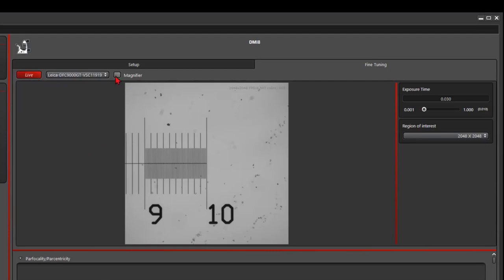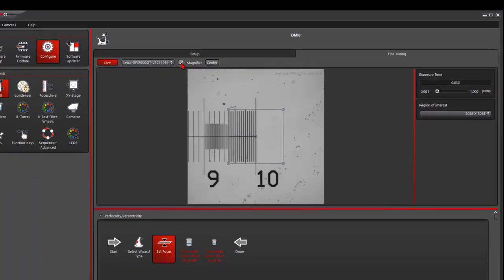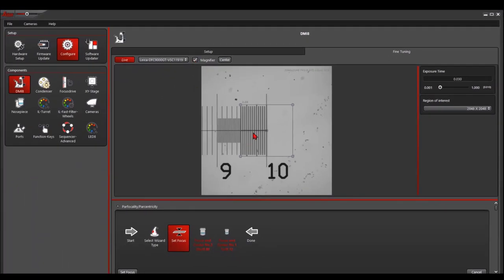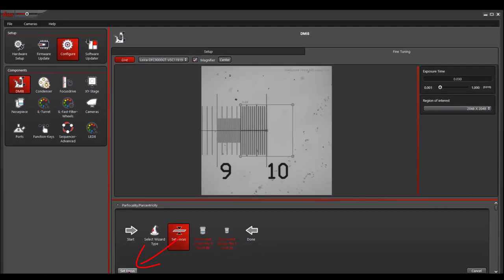You could use the magnifier to enlarge the picture. So after we found the focus, we click set focus.